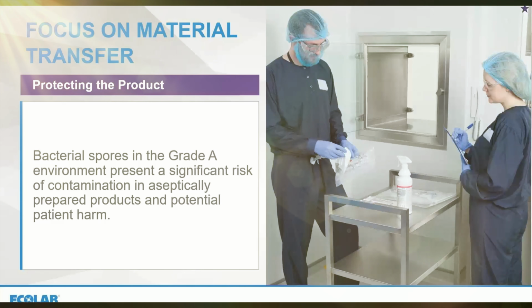And there's a particular concern with bacterial spores through this process, and there are some historical cases, some relatively recent, where there have been contamination events linked to bacterial spores. So we need to be very mindful of thorough disinfection and other control measures to minimise the spore risk going into our higher grade cleanroom areas.